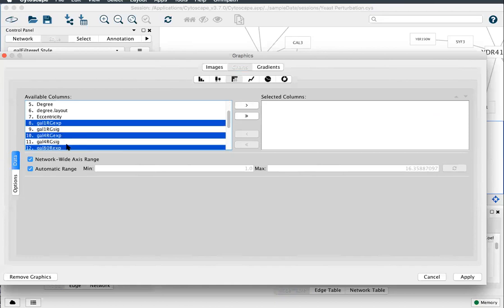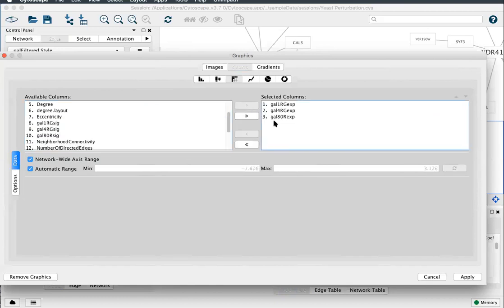One, two, three. I used command or control for multi-select. Bring them over. Those are our three values.